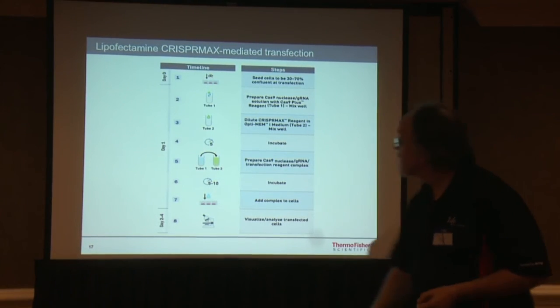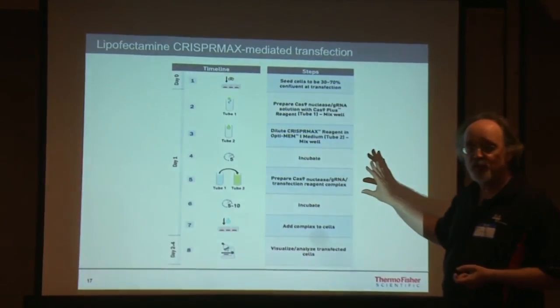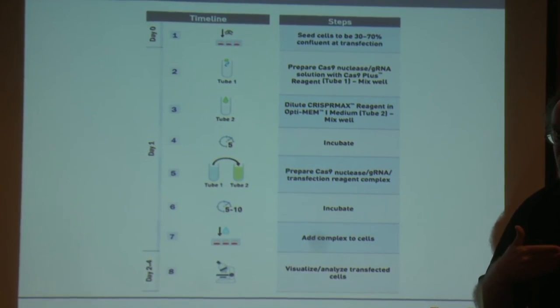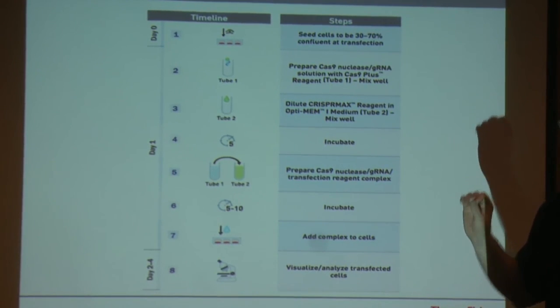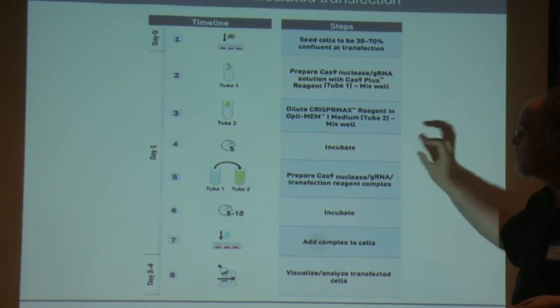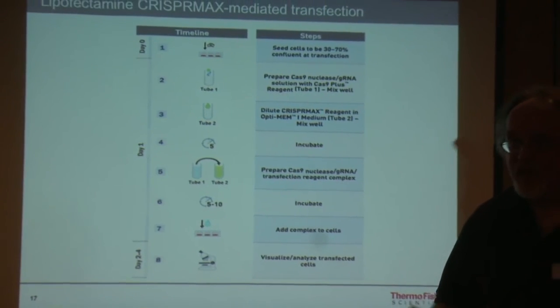Now we go through to the second step, which is starting to deliver this in and actually use it in the cell line. So we're now starting to come up with what we call validated workflows. The idea behind a validated workflow is you've standardized not only the design of the guide RNA and how to put the guide RNA together with the CRISPR, but you've also validated every aspect of how to actually do the experiment, all the way from growing the cells, through preparing the Cas9, through adding the two together and incubating it, and then being able to analyze whether the experiment has actually worked or not. These are all part of what we now call our validated workflow.